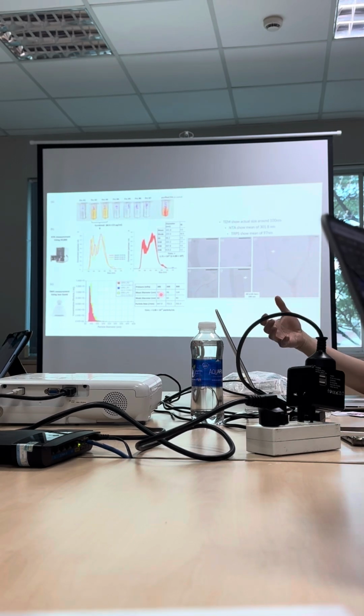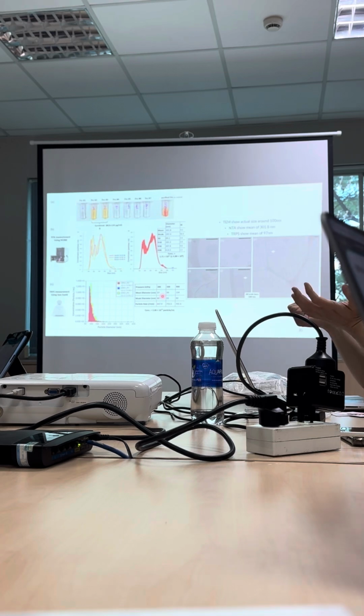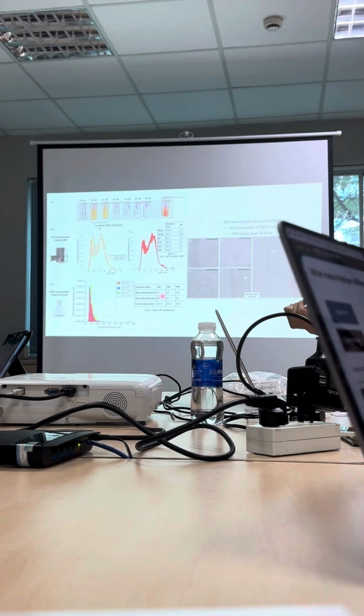This one will save money. If you use the other data, you need to guarantee that all the steps are sterile from the first time. By this, if you want to manufacture particles less than 100 nanometer, you only need the last step to be a sterilized filtration step. That is ready, and can be qualified as sterile samples.